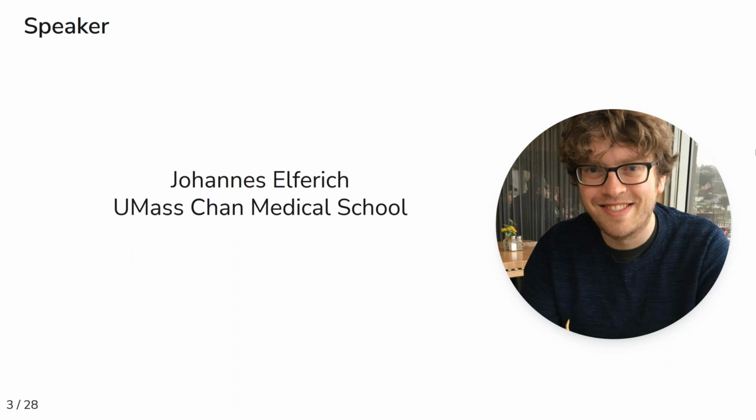In 2021, he joined the laboratory of Nicholas Gregorov to work on developing methods and software for high-throughput molecule detection in cryo-electron micrographs to enable visual proteomics. He uses a combination of single particle data acquisition and cryo-electron tomography to study localization, stoichiometry, and structural flexibility of the tip link in stereocilia, which are extracted from the inner ear of mice, furthering our understanding of hearing.